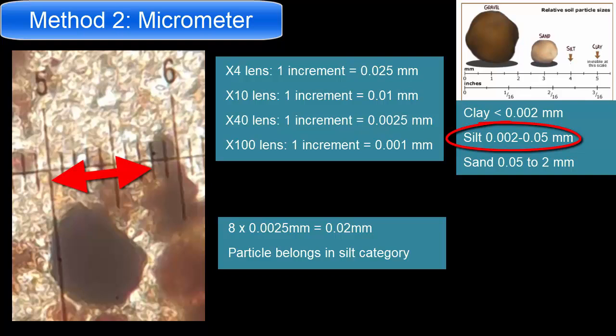And obviously there's huge errors here. This is just one angle on a 3-dimensional shape, and even if it's in 2 dimensions, it's not a circle, so there's longer and shorter parts of this particle, and that's just the one particle. So we won't worry about the numerous errors. I'm just trying to tell you how to work out an approximation of the size of one particle.